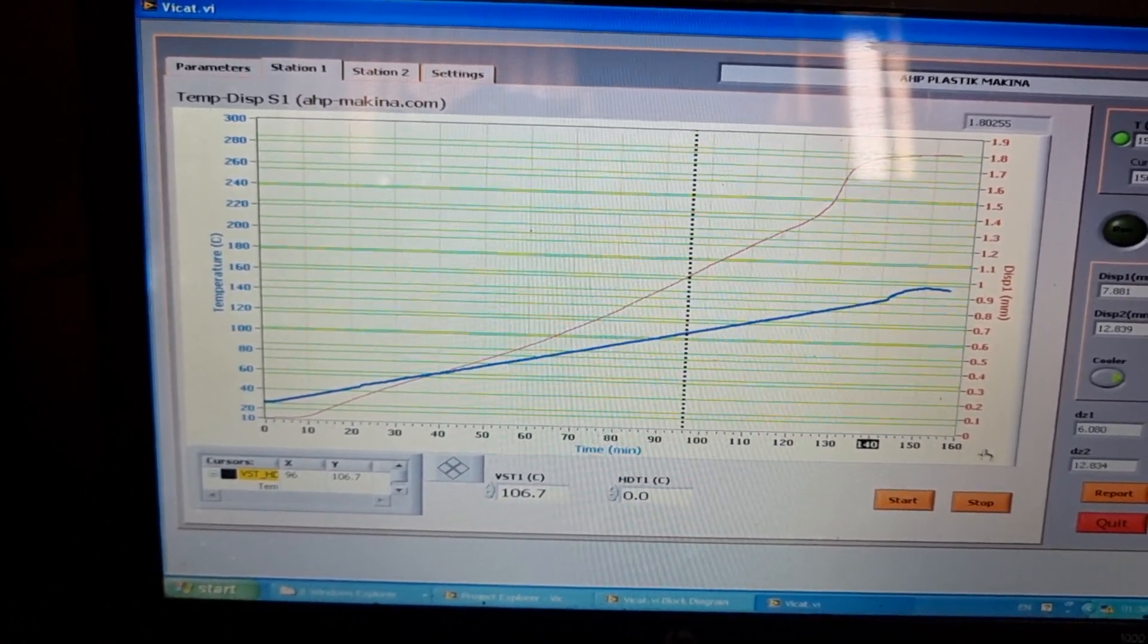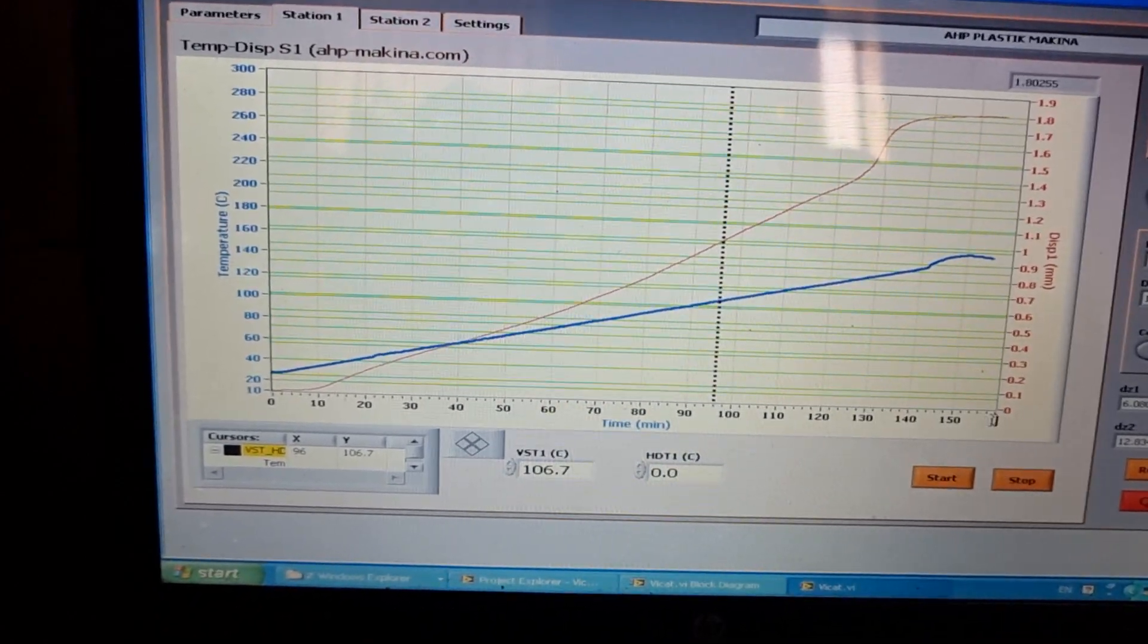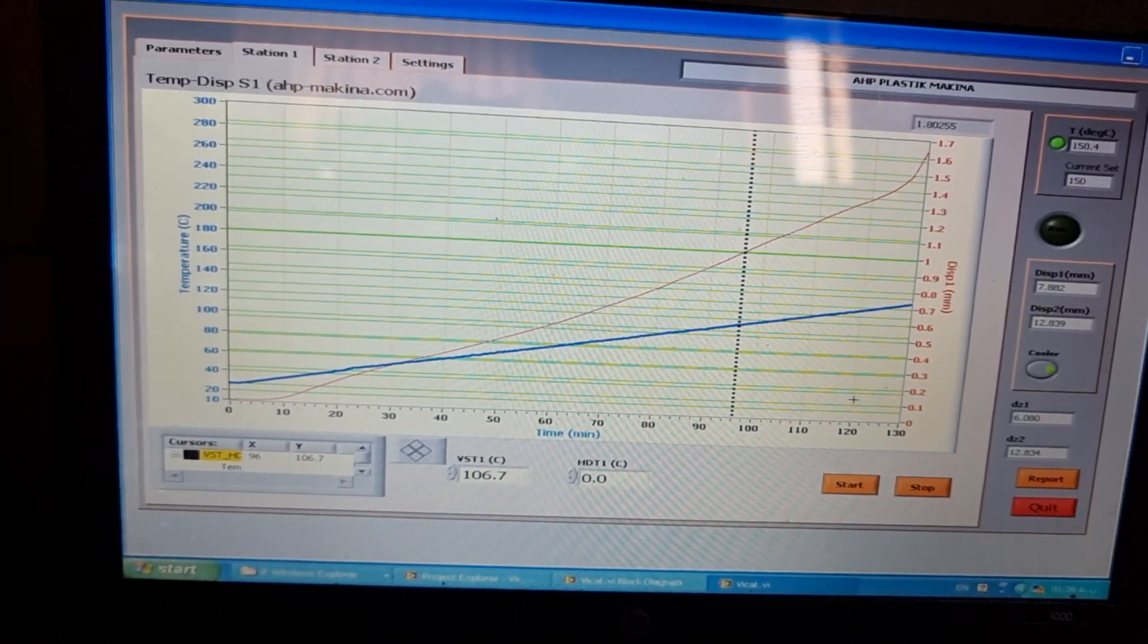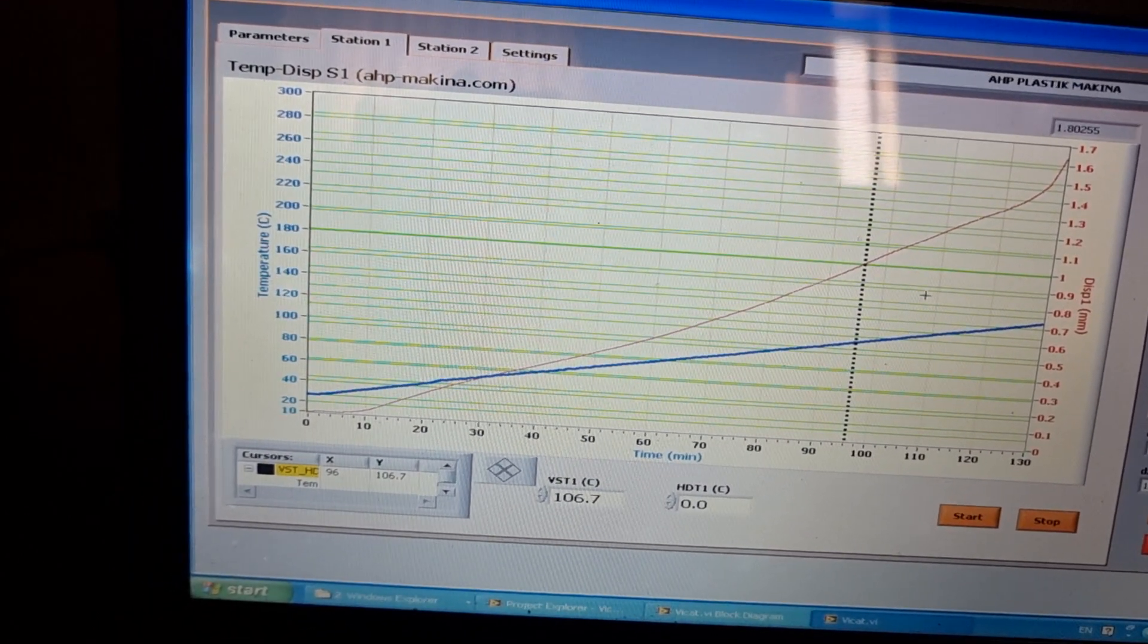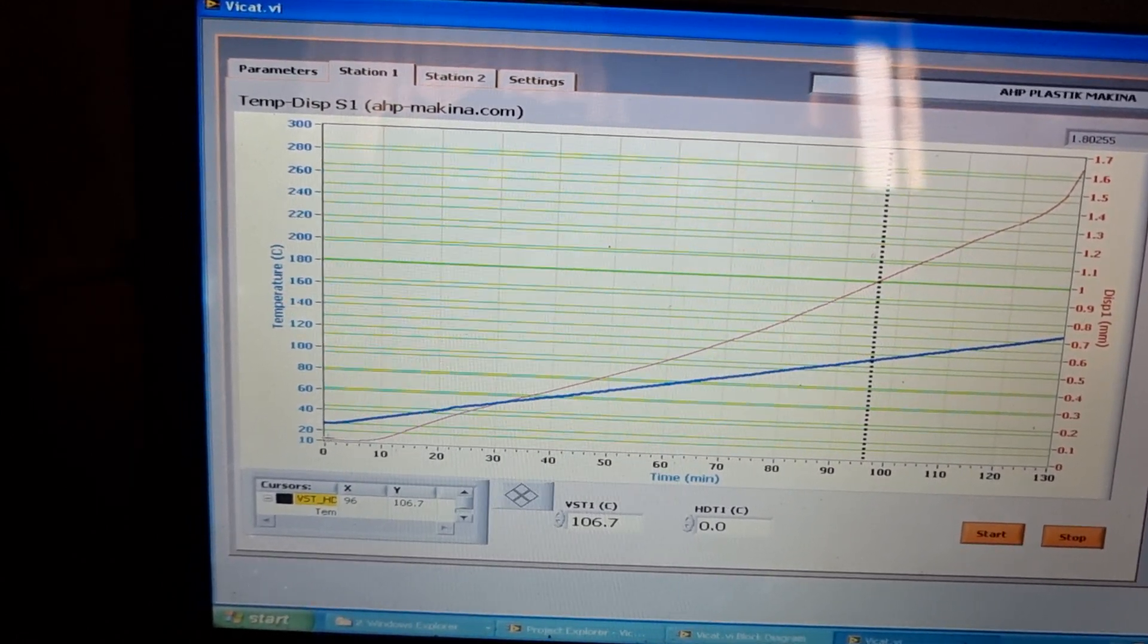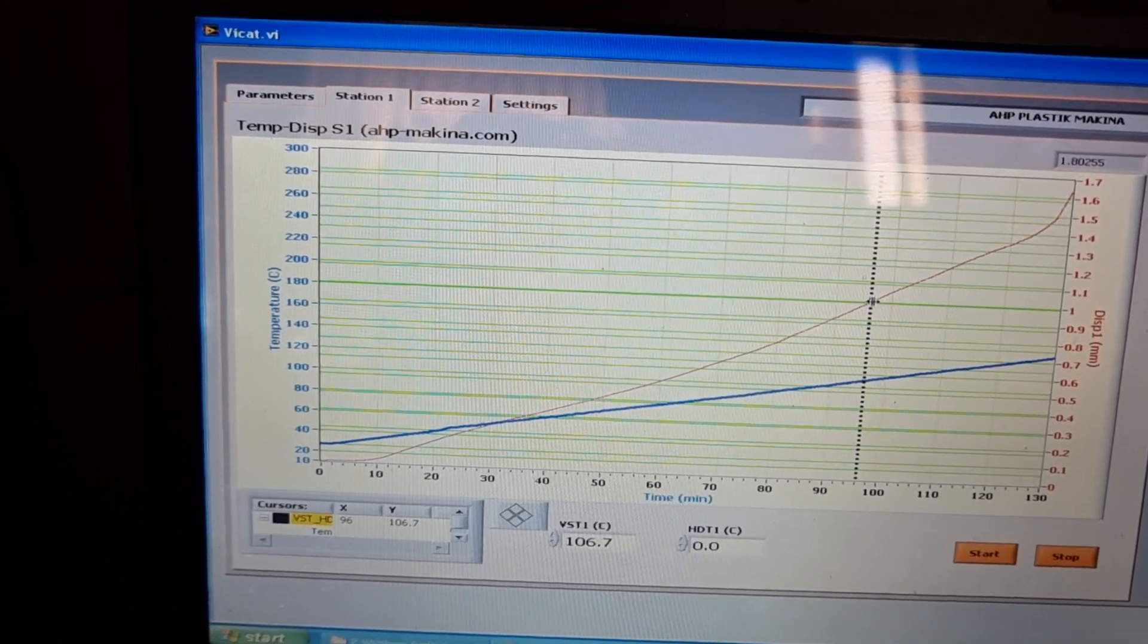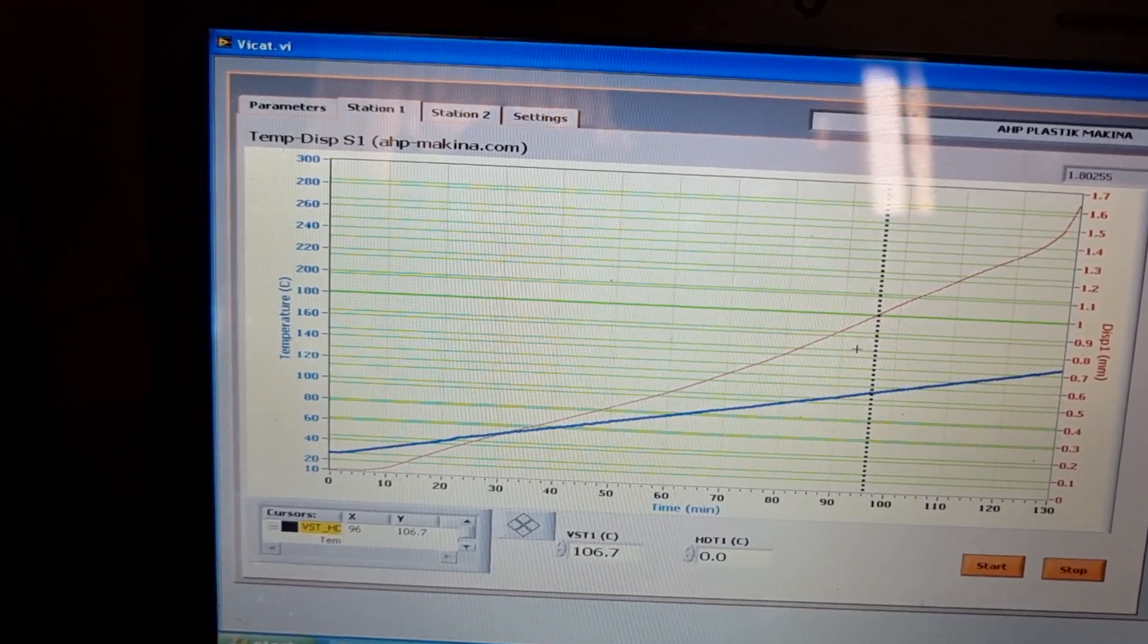I'm just setting this time graph to 130. You see it's a linear temperature increase here. The red color is the displacement of the sensor from the start. That was zero and it rises up to 1.6, 1.5 millimeters.